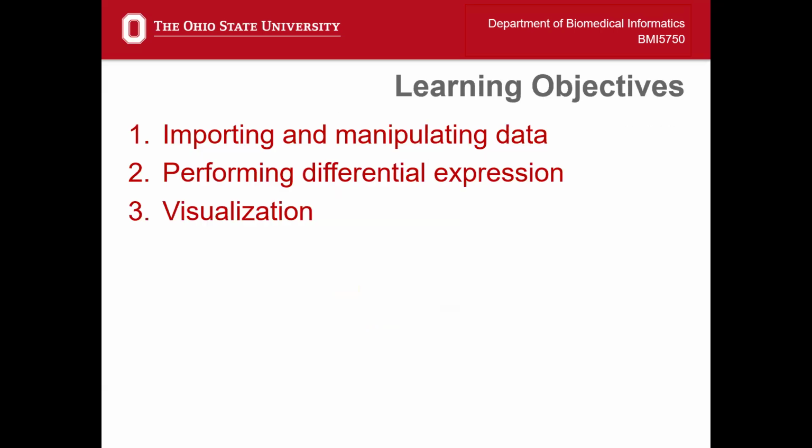Today in our lecture, we're going to be talking about importing and manipulating data from TCGA in R. We are going to perform the differential expression analysis. It's going to do statistics. And then we're going to look at different ways of visualizing those results. That is our differential expression pipeline.